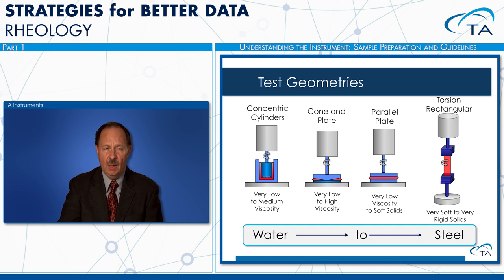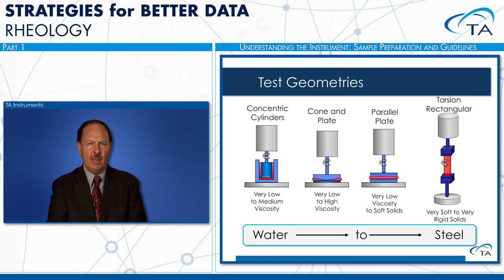With the cone plate, and we'll get into each one of these designs individually, the cone plate has some benefits. What you can see is if you go through the engineering mechanics of this design, you see that the shear rate and the shear stress are constant everywhere in this gap.